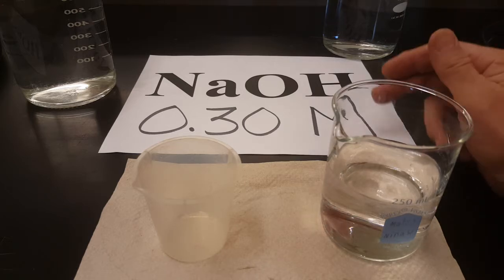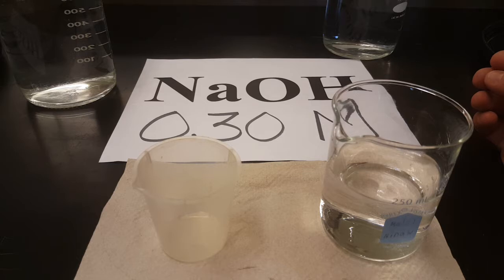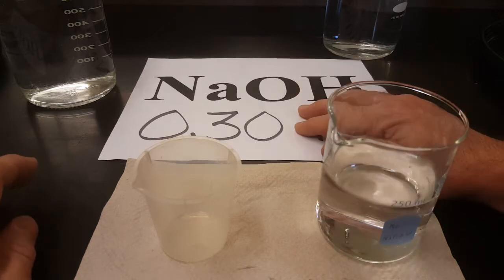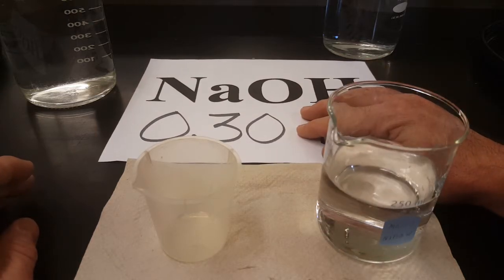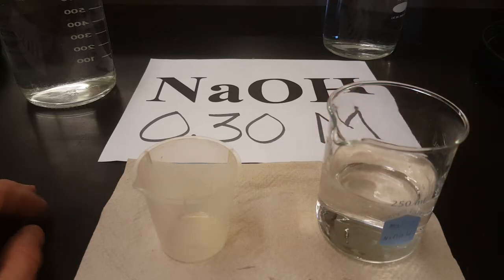I'm giving you the molarity of your base, which is your clue that tells you your acid molarity will be unknown. So your goal today is to figure out your unknown molarity of your acid. That's the point of a titration. We have a known molarity of a base. We're going to find out an unknown molarity of an acid.